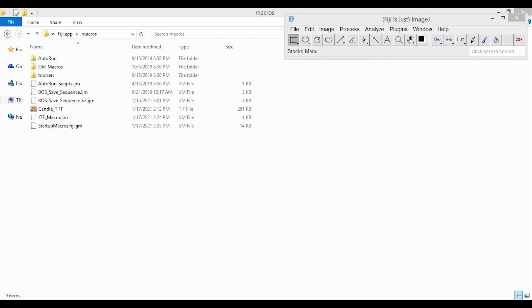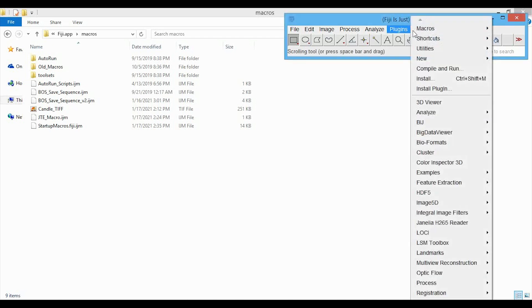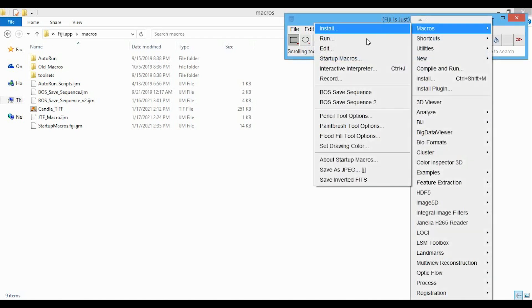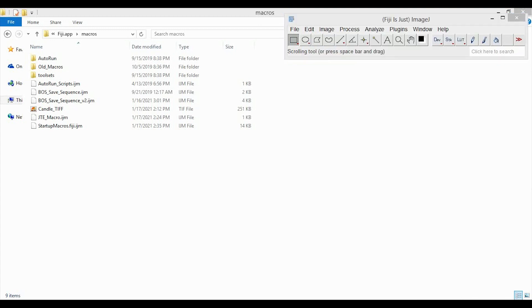Hey everyone, in this video I'll show you how to make sure your macros are loaded automatically when you start ImageJ, so you don't always need to go into the Plugins, Macros, and then Run menu to select your macro.